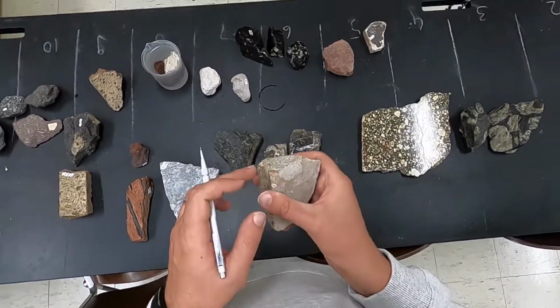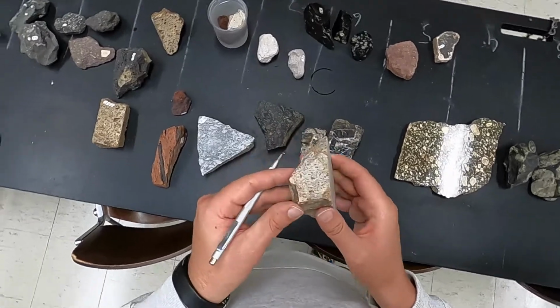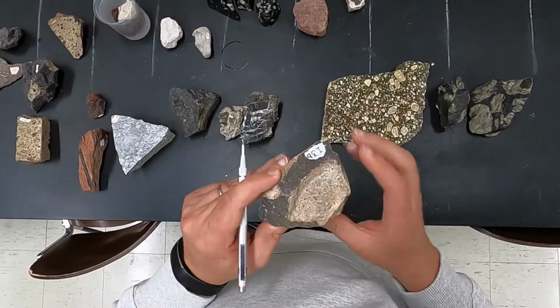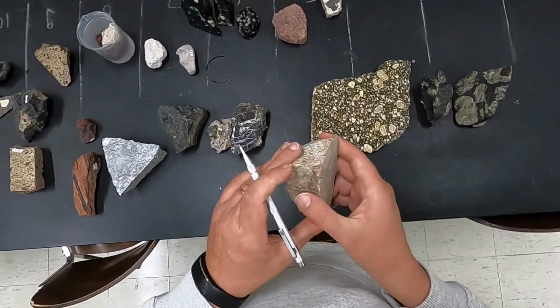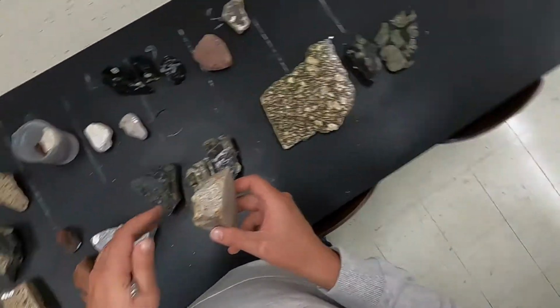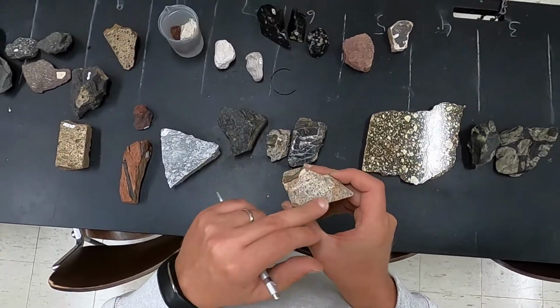The existence of amphibole can tell you that you are dealing either with an intermediate rock like a latite or a dacite. So this rock could be classified as a dacite or latite, or even an andesite in some cases, might have this peculiar mineral assemblage. So again, we need magnification.